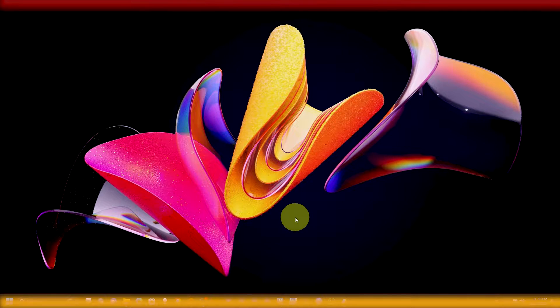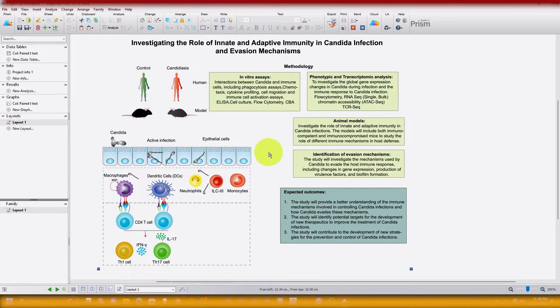Hello friends, welcome again. Today I am going to show you how you can solve all your problems regarding figure resolution, format, and figure size during paper submission in the journal with the help of GraphPad Prism.